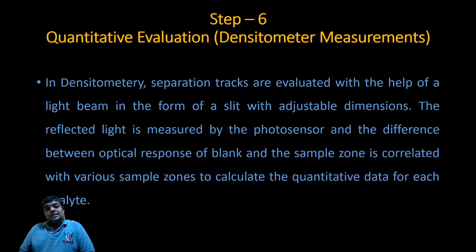Step 6. You are getting the spots. But have you ever thought that these spots that have been just separated on a TLC plate can be converted into peaks? No. But this can be done when human intervention is gone and instrument intervention or computer intervention comes into existence. You are here for increasing its performance. You need to know it.